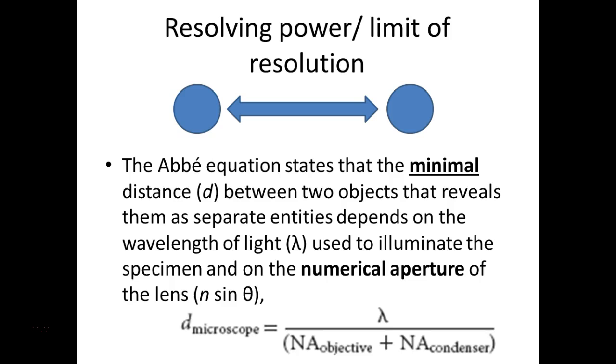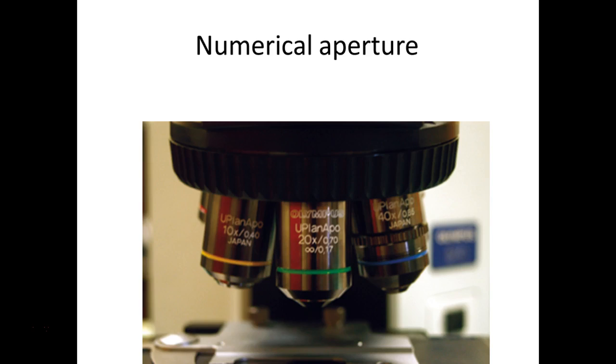So we could calculate this. We know the wavelength of light, and you know the prescription, say, for those lenses, that numerical aperture for the lenses on that microscope. You could use this formula and calculate that distance. So you know how close you could put them together and someone would see them as being separate, and when you wouldn't. The good news is you guys are in lecture class. We don't deal with the math stuff in lecture. In lab, you have to know this. In this class, you just have to understand it.